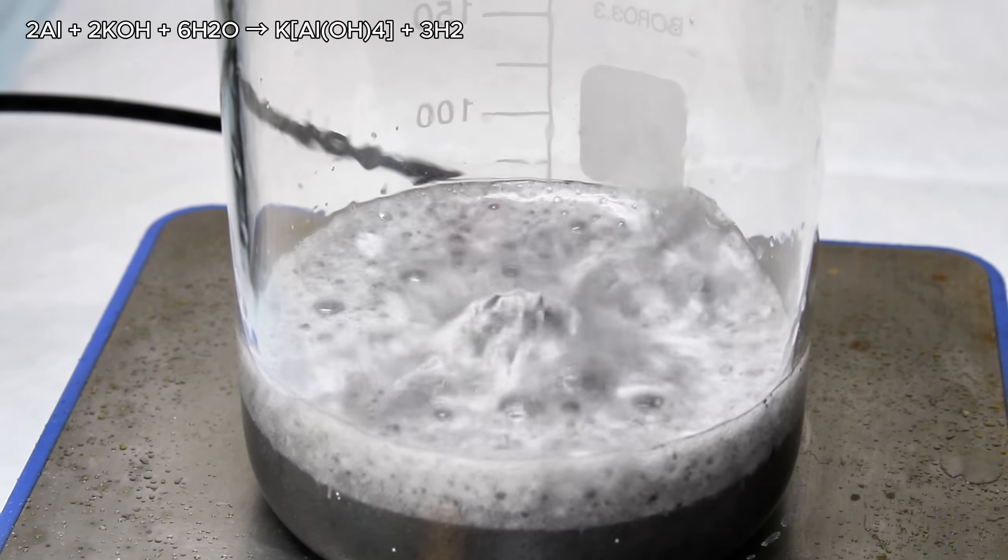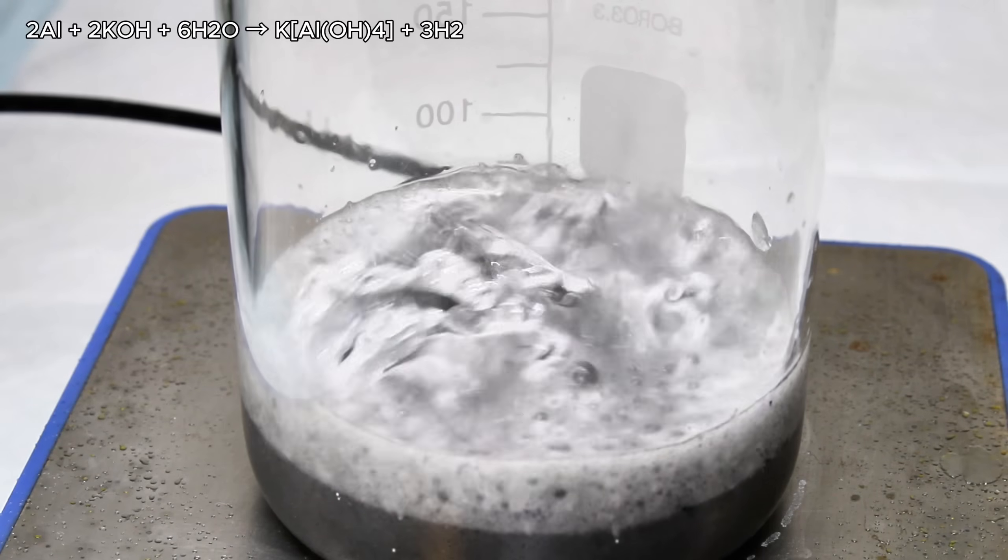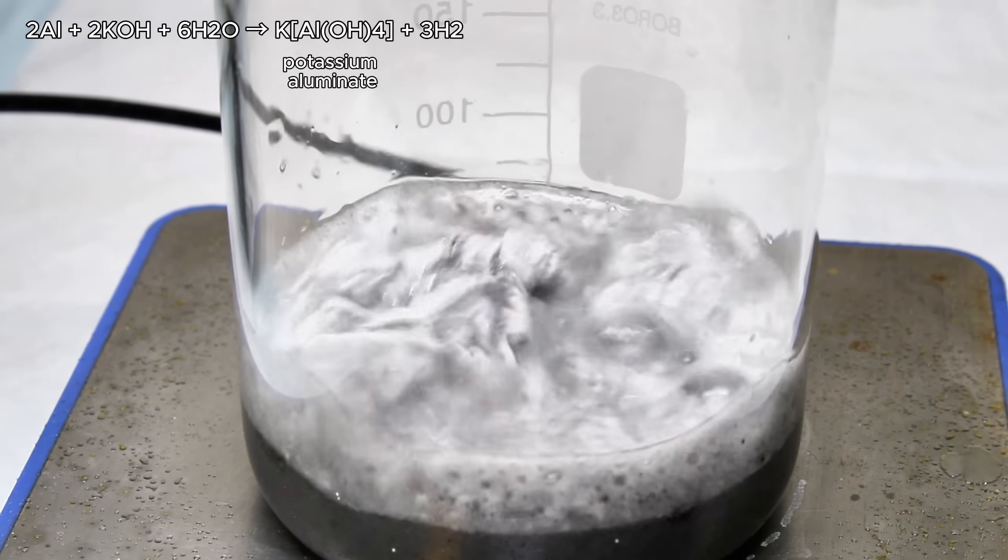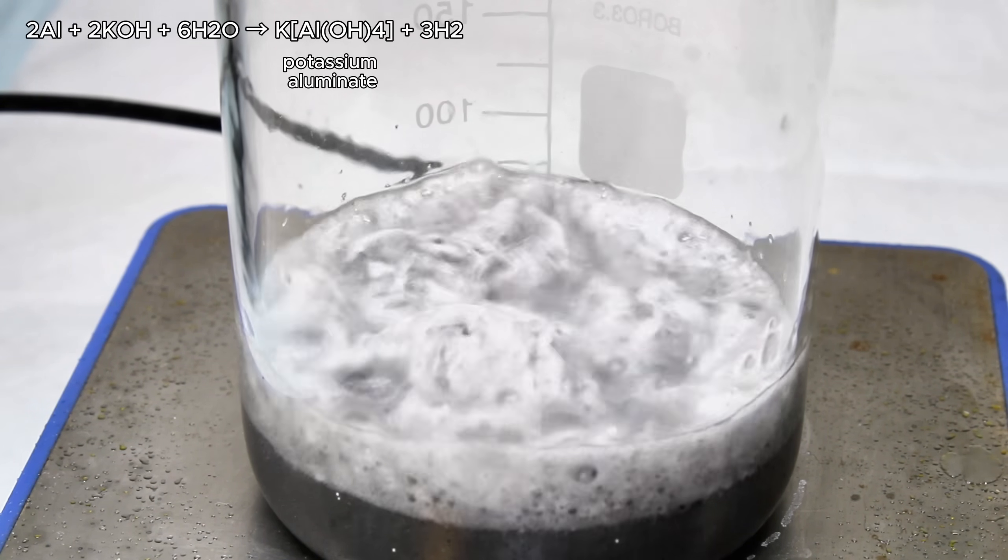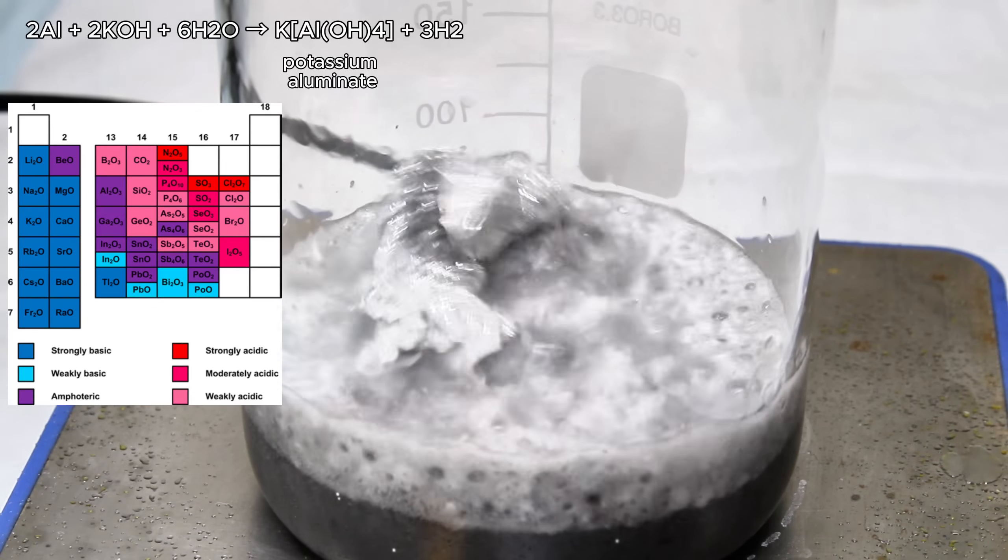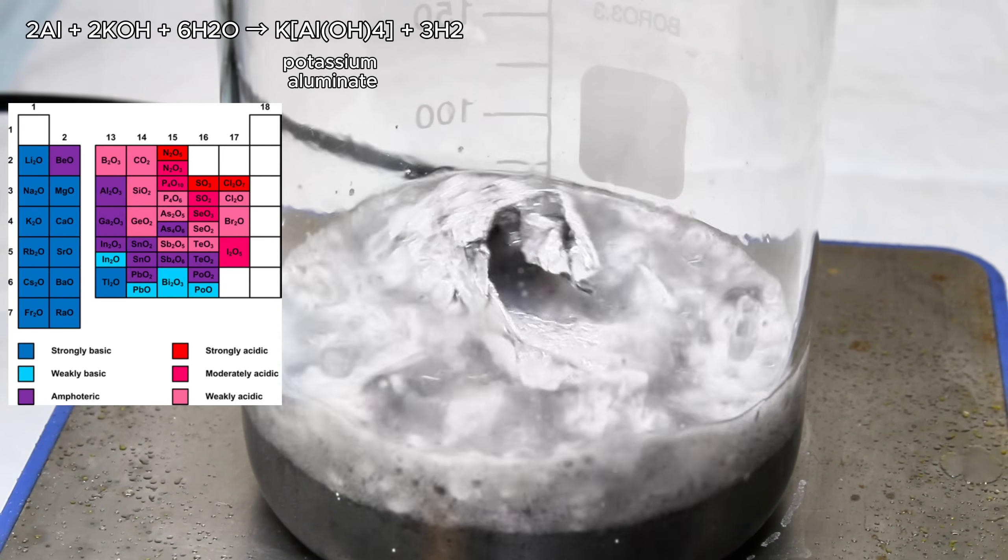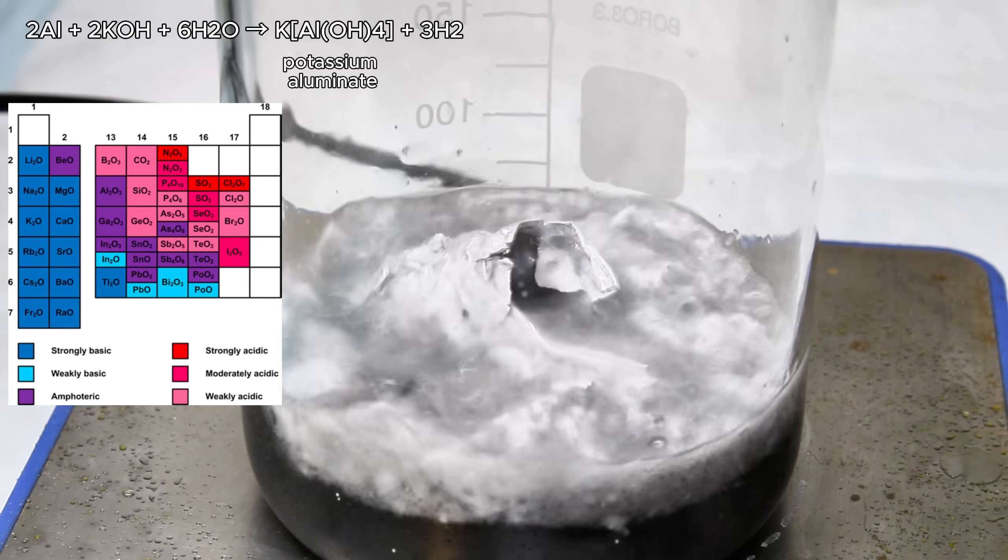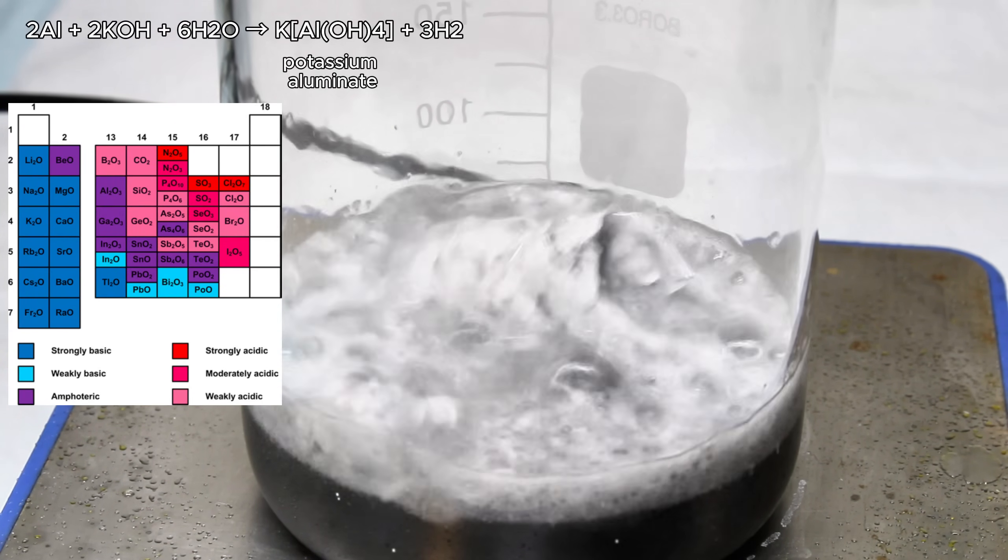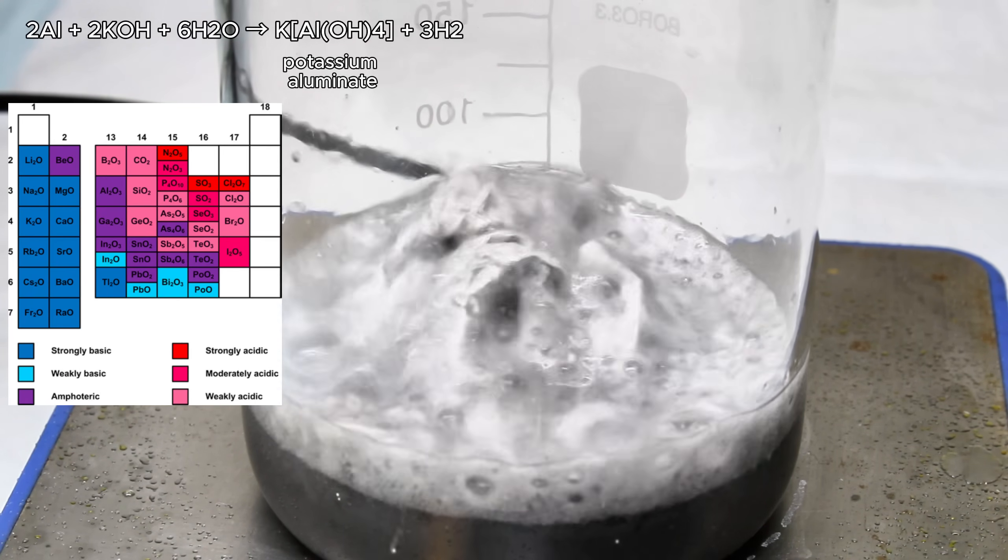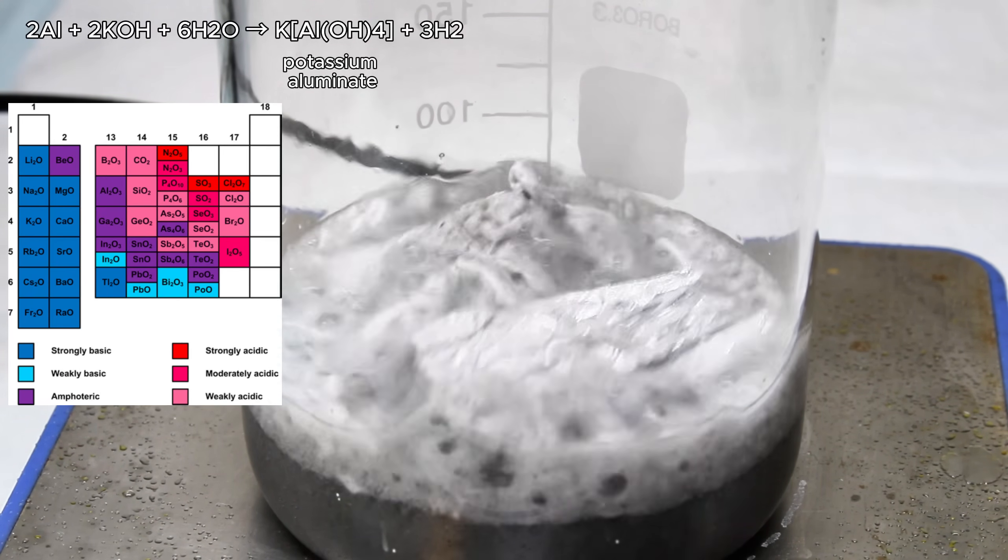The other product of this reaction, and the one we're after, is the salt potassium aluminate, which is possible because aluminum is what's called amphoteric. Amphoteric metals such as aluminum, tin, chromium, lead, etc., can form highly soluble salts upon reaction with bases, as well as acids, which I find pretty cool.